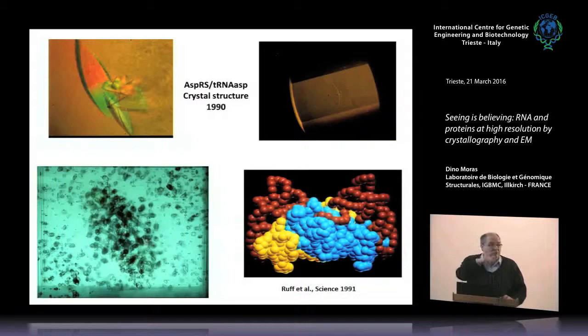There again, another point that I want to make, the difference between a functional complex and a model complex. That's a functional one. Functional means you can run the reaction inside the crystal. That's the best proof that you have a functional one. Even if the kinetics is different, of course, it's much slower. You're talking in terms of hours or days and not seconds or tenths of a second. But it works. So what you see is really a functional complex.